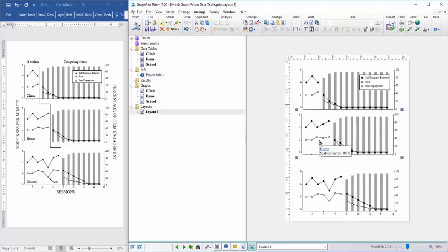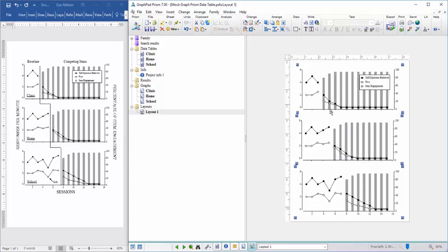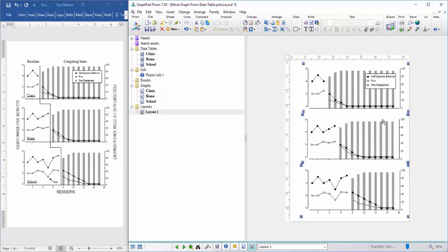The other thing I want to show you is, for some reason, if you moved a graph and you have different spacings in between your 1st and 2nd panel as compared to your 2nd and 3rd panel, what you would do is just select all, and then under arrange, there's another equalize feature, and this is equalizing the spacing between objects. You'd click on this and do vertically, and this would put equal spacing in between your graphs. If for some reason your graphs are off center on your page, what you do is again select all and then click center everything on the page, which is the top right feature.